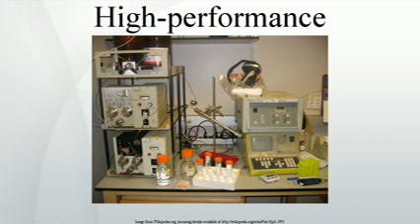Particle size. Most traditional HPLC is performed with a stationary phase attached to the outside of small spherical silica particles, very small beads. These particles come in a variety of sizes, with 5 micron beads being the most common. Smaller particles generally provide more surface area and better separations, but the pressure required for optimum linear velocity increases by the inverse of the particle diameter squared. This means that changing to particles that are half as big, keeping the size of the column the same, will double the performance, but increase the required pressure by a factor of 4.